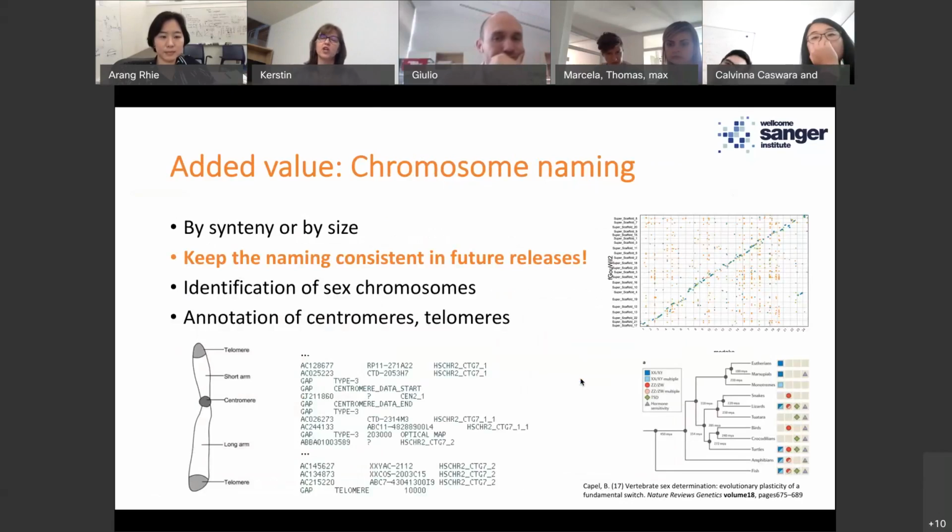So if we have a very close relative available, like in this example here, where we had a fish and aligned this with Medaka, which already had a chromosome level assembly of a decent quality, we can see clearly that each of these chromosomal units or chromosome scale scaffolds aligns clearly to one chromosome in Medaka. We just take the Medaka chromosome numbering so that everyone who does analysis later does not have to juggle different numbers.